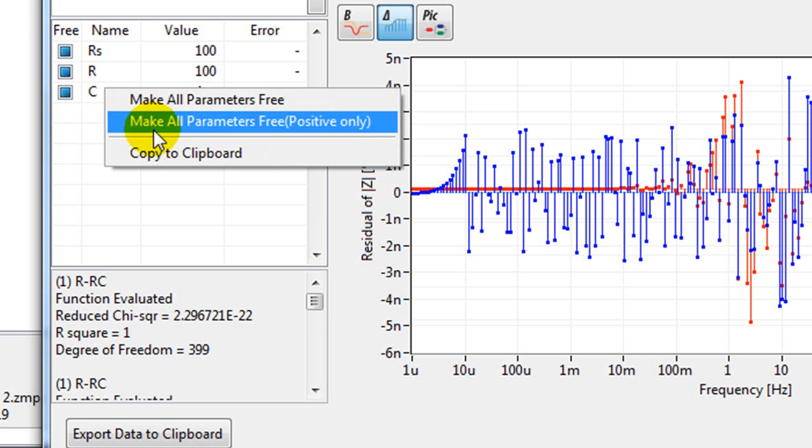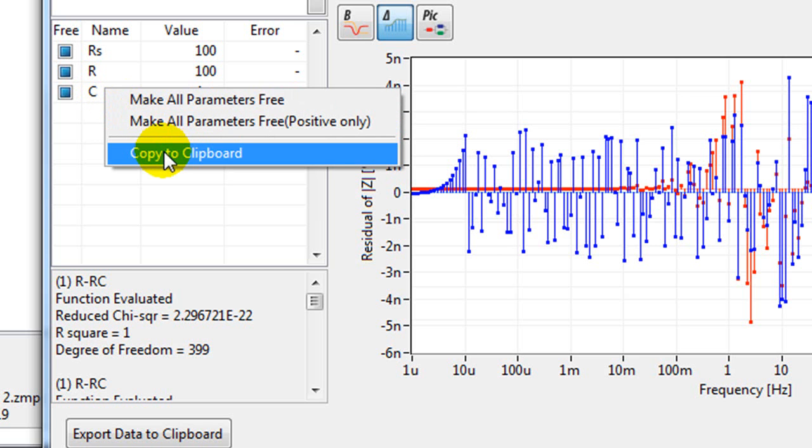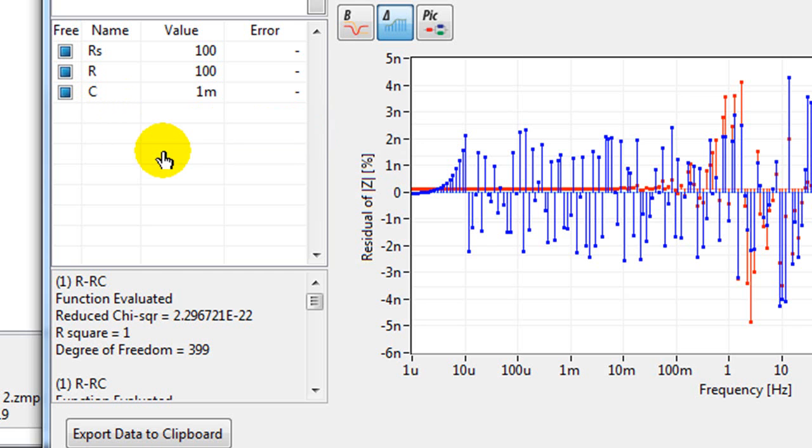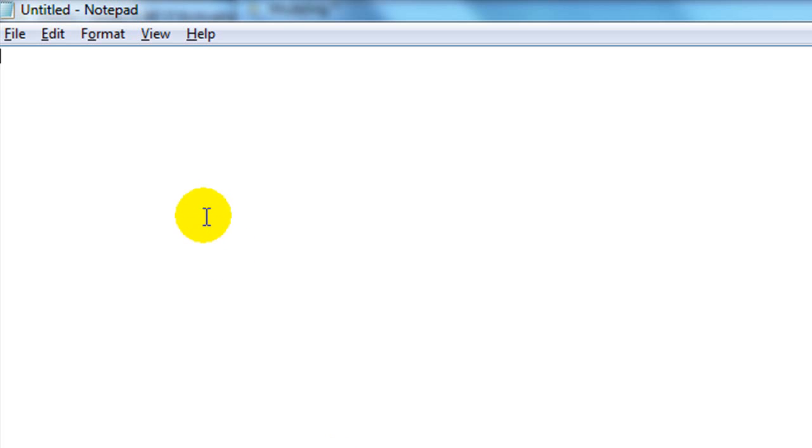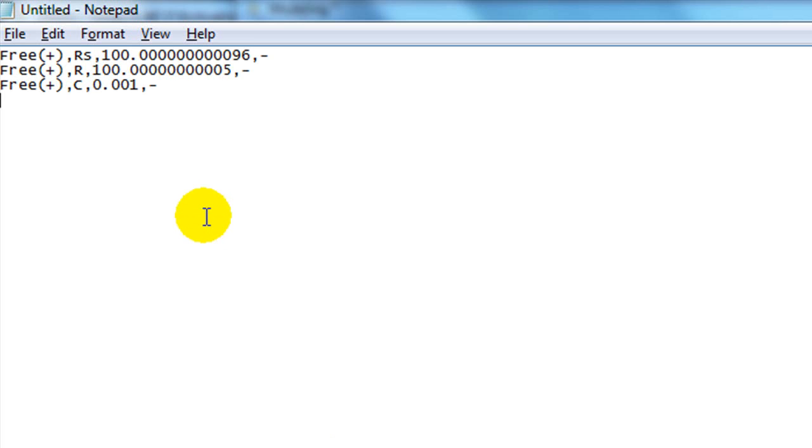If you click copy to clipboard, it will copy those values to the clipboard. And in Notepad for example, you can copy those values in there.